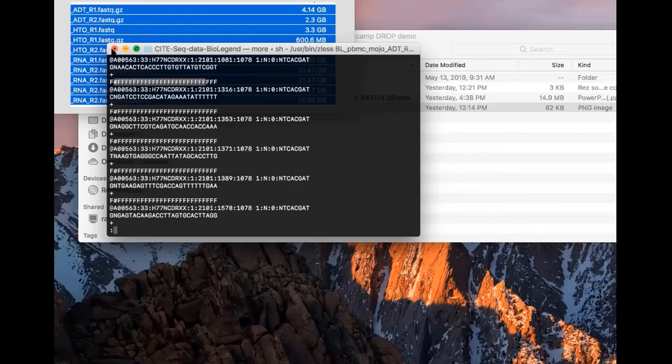This file is really big. Again, you want to find your bioinformatician to help you analyze it. But if you are interested in learning how to do it, there are many online education resources available. You can Google it and find out.